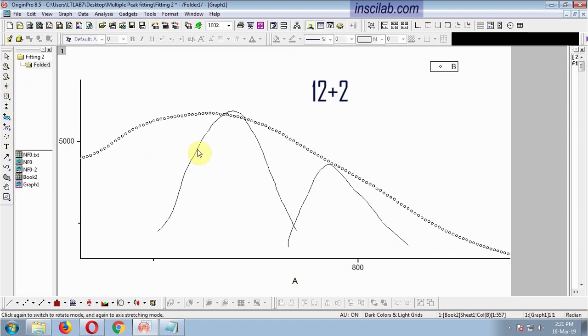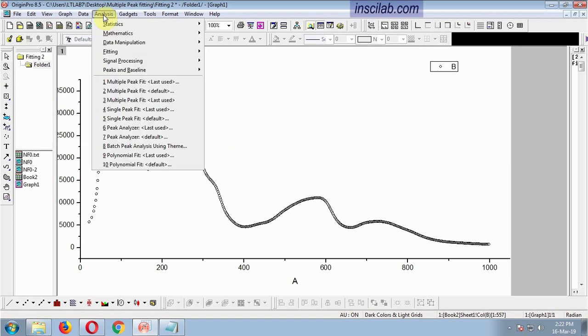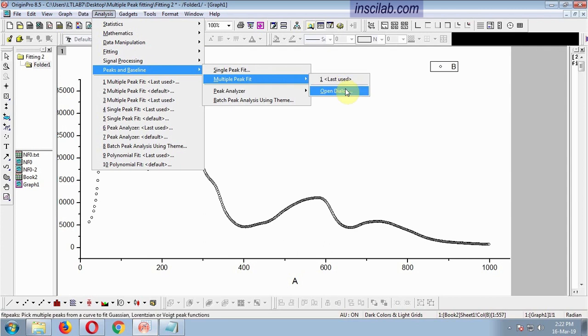If you are confused with the number, don't worry. Make a few trials between the minimum number of possible peaks and the maximum possible number of peaks. Start with the minimum number and follow the steps I am showing. Go to Analysis, Peaks and Baseline, Multiple peak fit, Open dialogue.